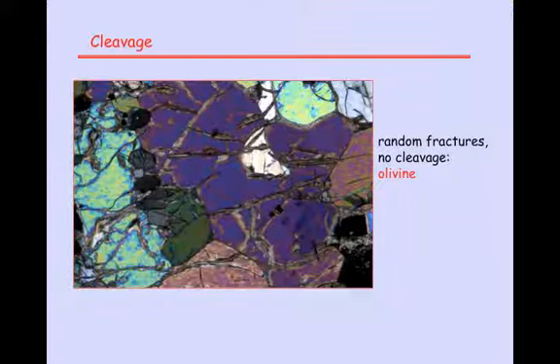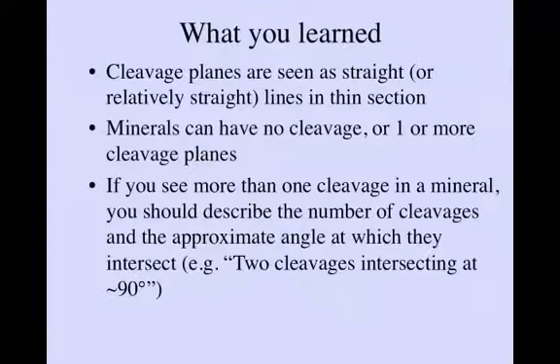And you have to take some care that you're really seeing cleavage and not just fractures through a crystal when you're looking at it. And sometimes, to actually spot a cleavage, you need to increase the magnification on your microscope to get in close enough so that you can see those cleavage surfaces.